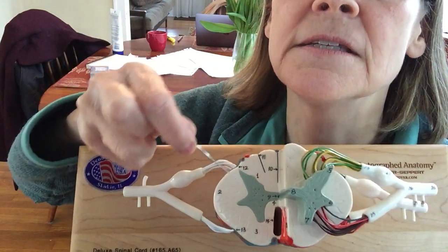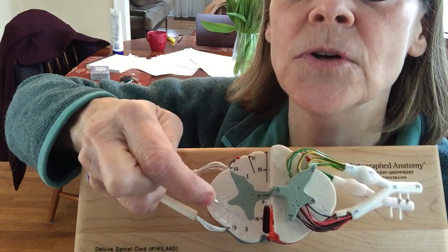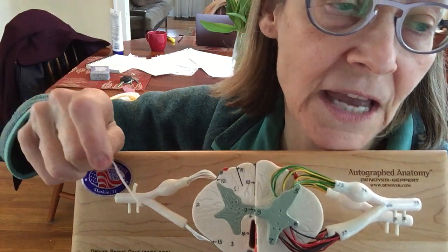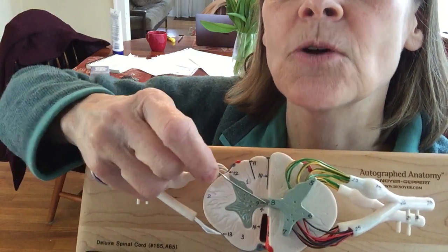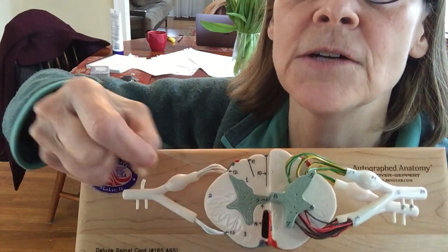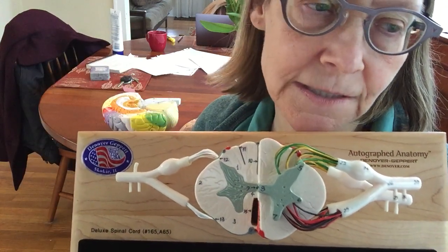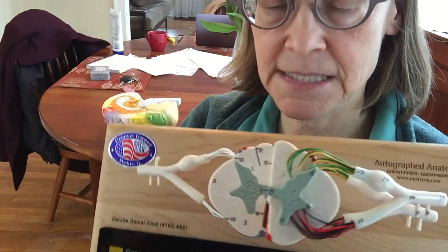All right. This is the dorsal horn, this horn coming up here, same over here. This is the ventral horn down here. In this particular section, there's also a little lateral horn coming out like this, but quite often you don't see that. Quite often you just see a big dorsal horn and a big ventral horn. This looks like a thoracic section to me in terms of how the butterfly or H shape looks. All right. Then in the middle is the central canal.